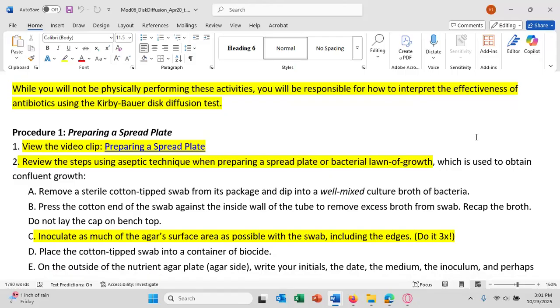And then you take your plate, and you spread with the cotton swab everywhere on the plate to get bacteria to grow everywhere on the plate. Hopefully you can see this. Can anyone confirm you can see this? Yes. Okay, great. Then you turn the cotton swab a quarter of a turn, and you turn the plate a quarter of a turn. And then you repeat swabbing everywhere.